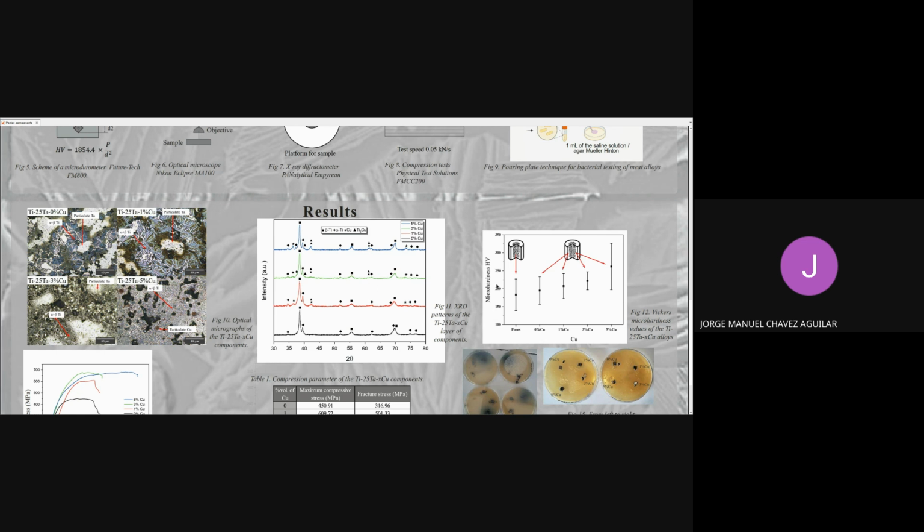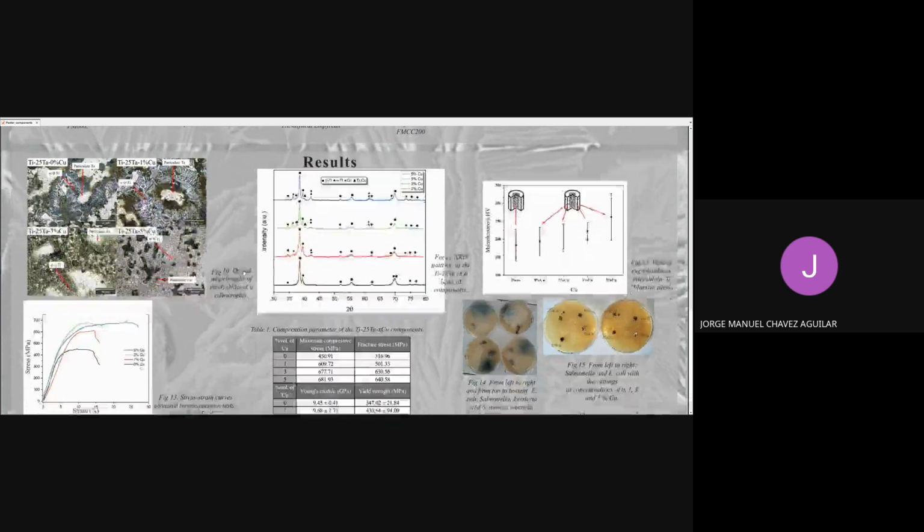After this, the microhardness revealed a trend of increase in the values of microhardness, which is appropriate for the components, because this could be an indicative of higher structural resistance, which is desired for the components.